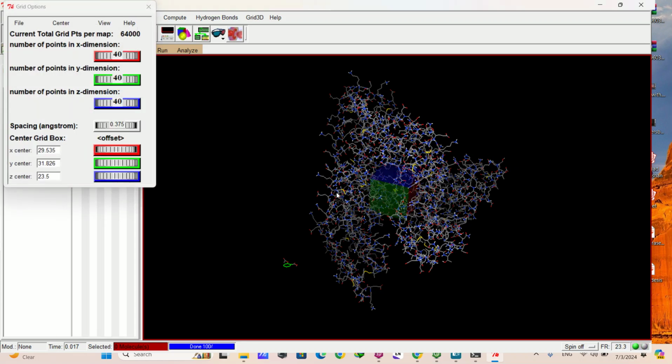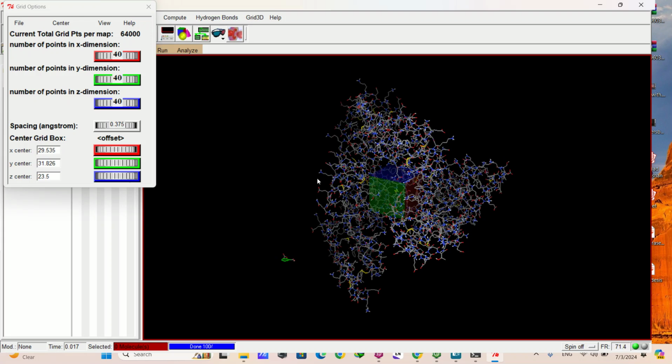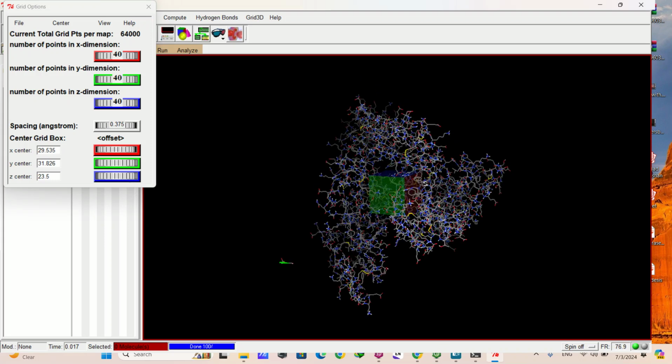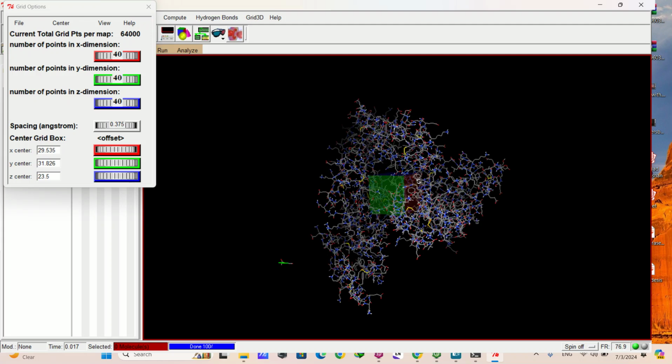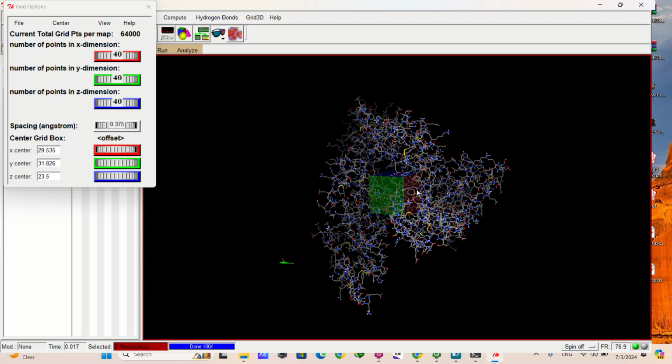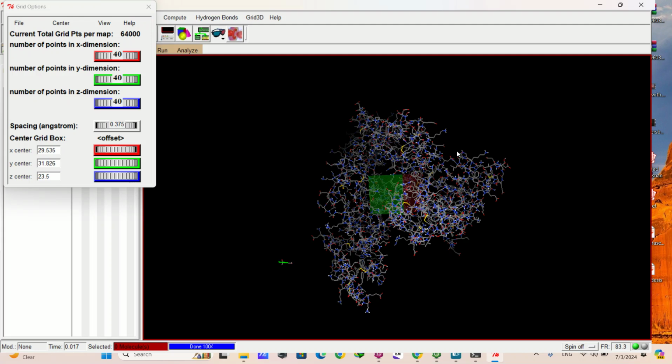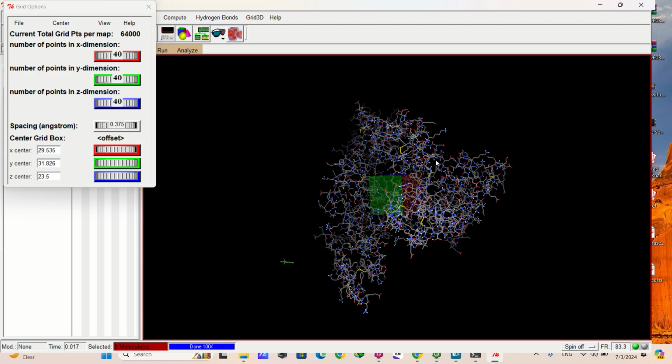And this is the most important part about docking. I told you a little earlier that you should write down the coordinates of the center atom of your ligand molecule. But no, in blind docking it's not important. Why? Because you don't know the coordinates of the active site, and you should figure it out. How should we figure it out? Your grid box should contain all of your receptor, because you don't know exactly where your active site is. So you should select all the receptor into the grid box, and after doing molecular docking, after calculations, it will tell you where the drug or your ligand would attach perfectly.